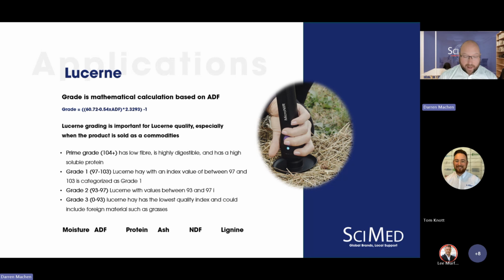to give you the capability to take the lab-based instrument into the field, which is what we all strive to do, to get the most representative sample. You take a sample, you send it back to the laboratory, you wait 2 or 3 days, you get the results. What would be amazing is if you can take that device into the field, and this is where we can teach the NIR the parameters that you wish to predict.